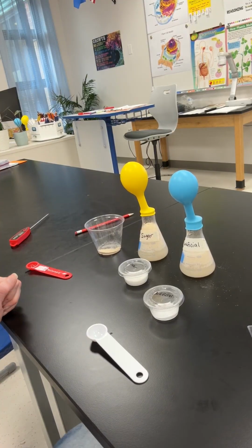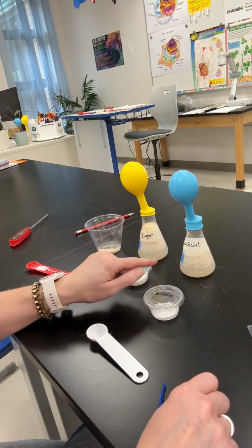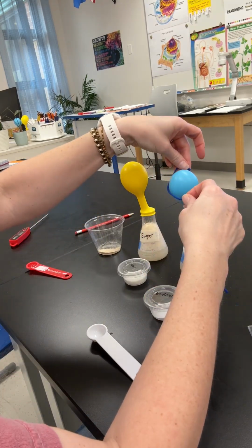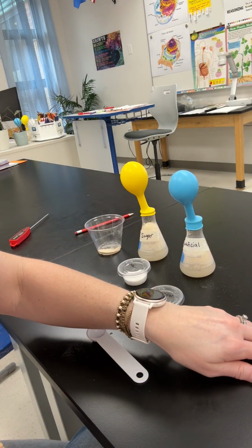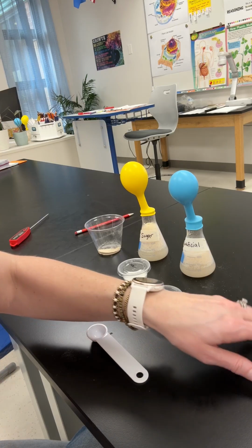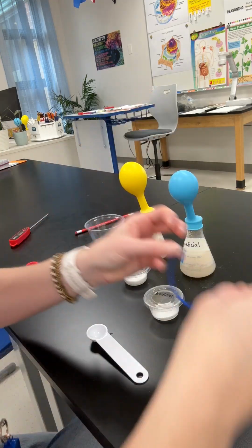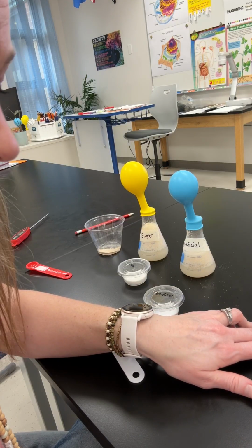Okay, we're going to do our last measurement. Now the artificial has popped up. You can see it's also increasing bubbles, but the sugar is still doing more. Artificial is at 16. And sugar is at 18.